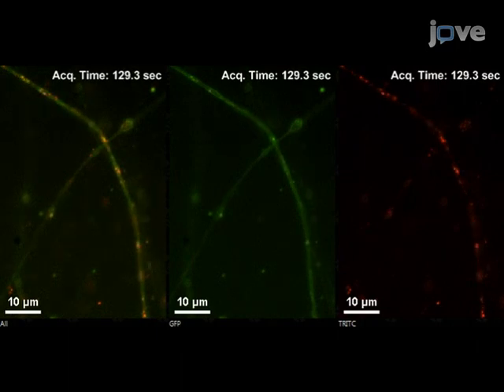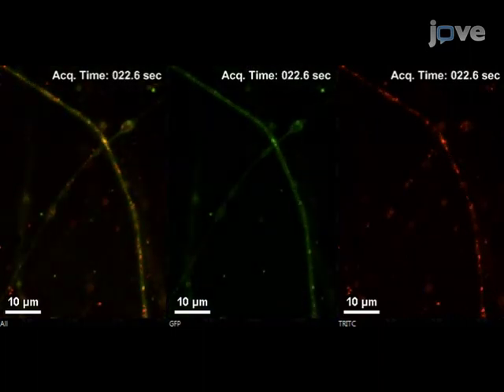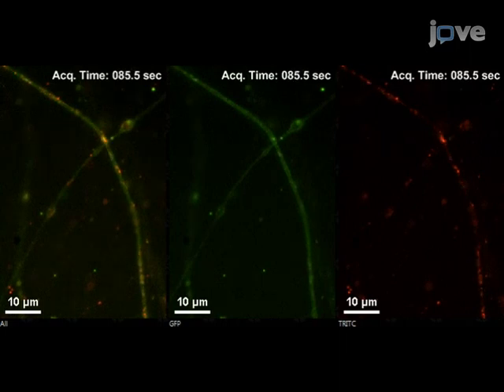Incorporation of these fusion proteins into viral particles results in their detection on transporting puncta, as visualized by the moving fluorescent dots. The aforementioned imaging conditions minimize the offset of each fluorophore on a moving particle during filter switching.